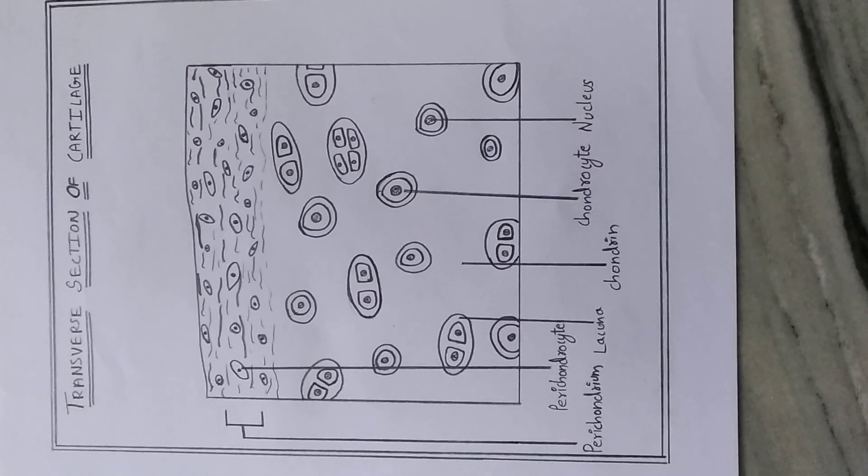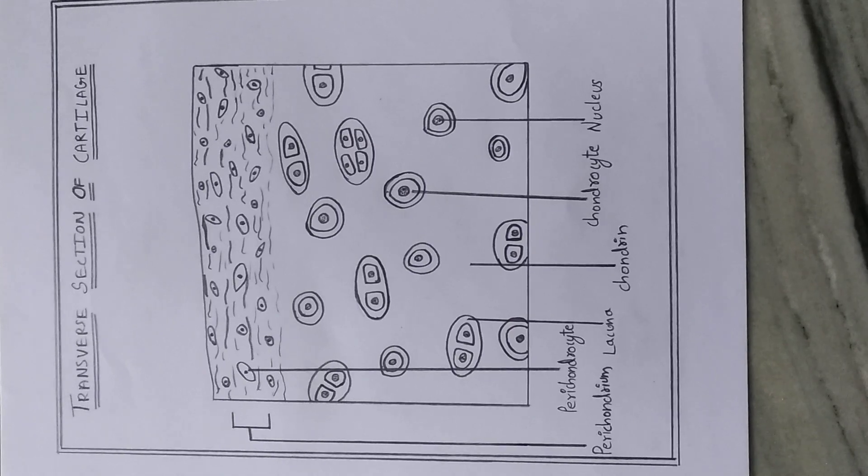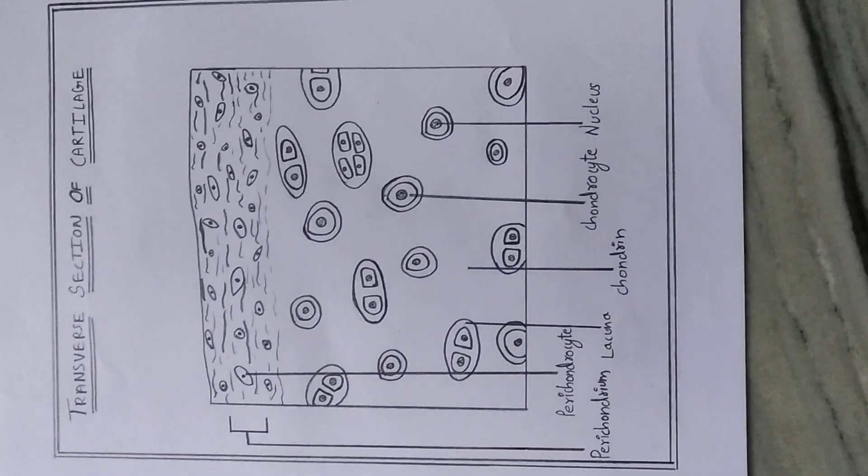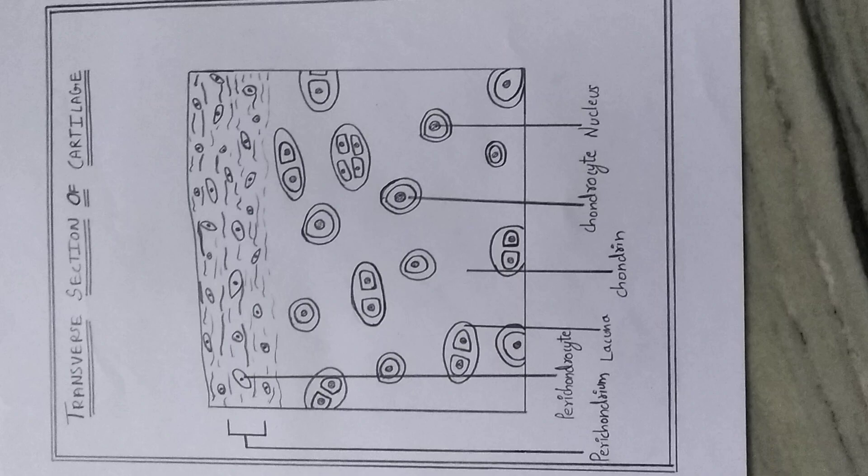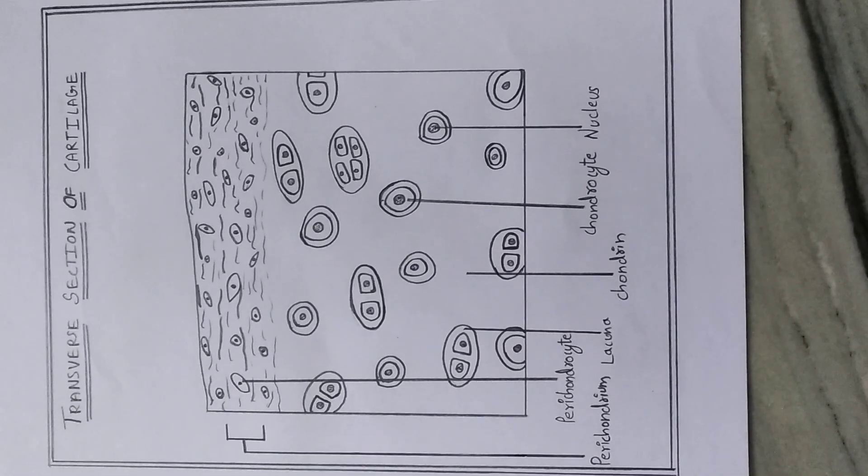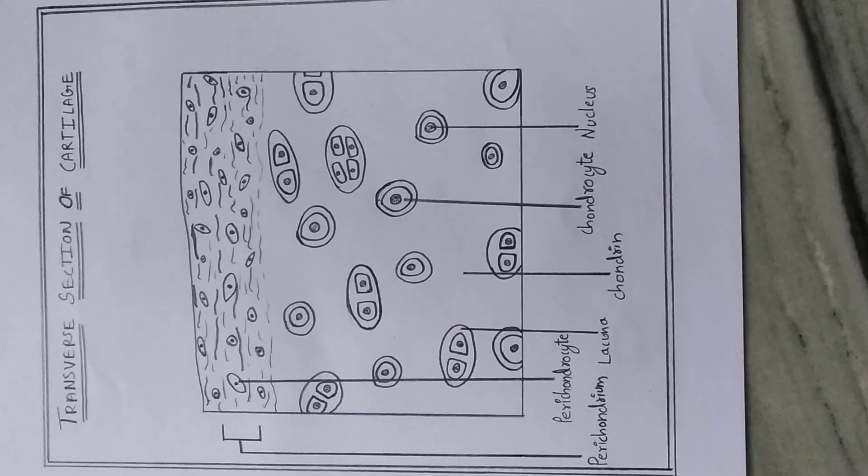This is a transverse section of cartilage. Its identifying characters are: cartilage is semi-rigid and somewhat flexible, and it is also called gristle. There are small spaces called lacunae in the matrix called chondrin. Each lacuna has one to four chondrocytes.